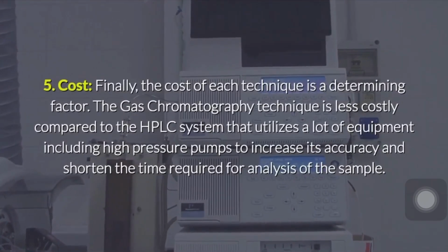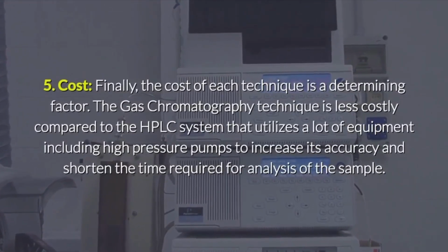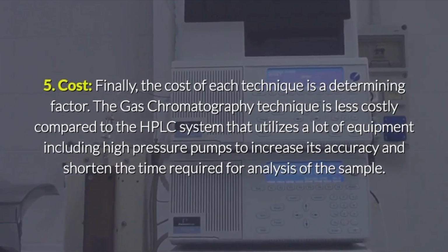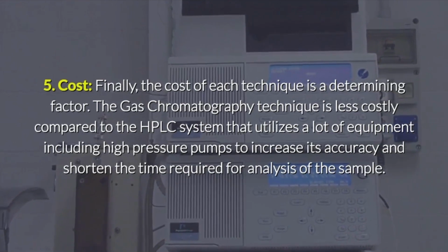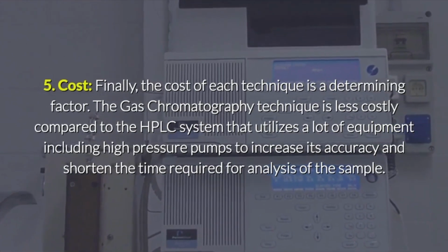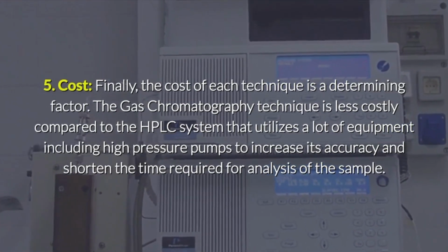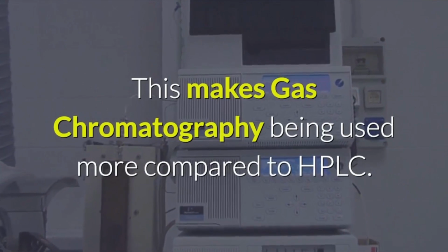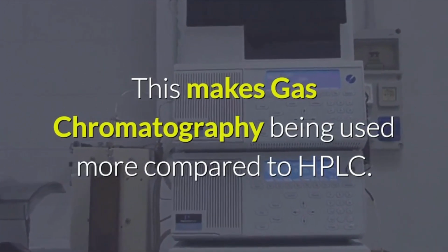Cost. Finally, the cost of each technique is a determining factor. The gas chromatography technique is less costly compared to the HPLC system, which utilizes a lot of equipment including high-pressure pumps to increase its accuracy and shorten the time required for analysis of the sample. This makes gas chromatography being used more compared to HPLC.